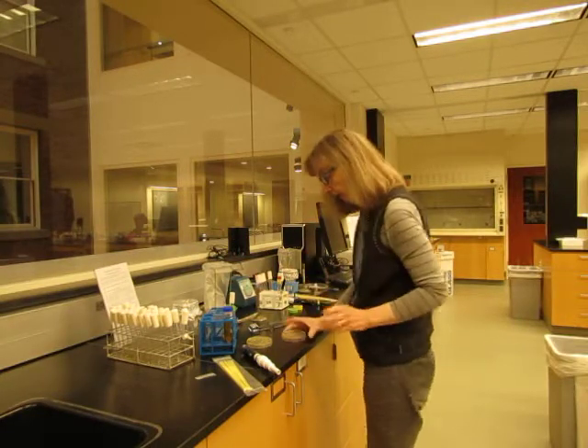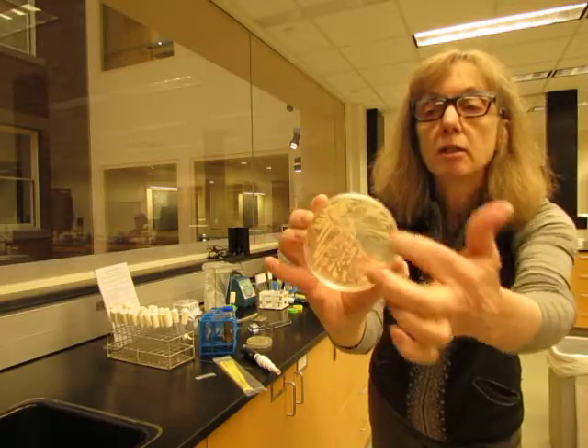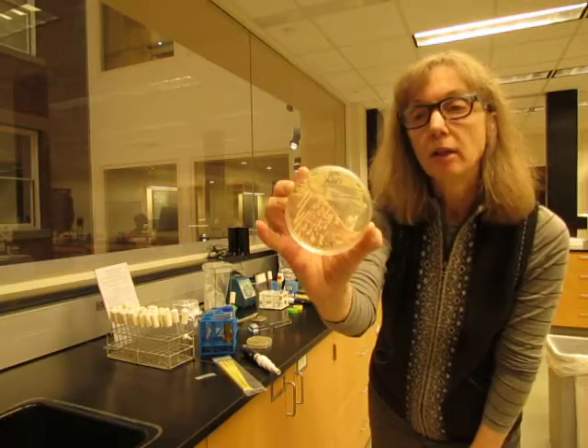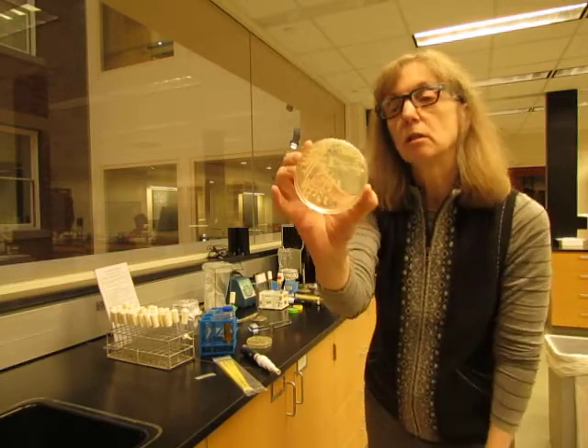I want to point out on another plate something that you shouldn't do. You can see on this plate that someone has swiped across — not individual colonies, but a lawn of colonies. That's not the proper way to do it. You should be grabbing individual small colonies to start your cultures.